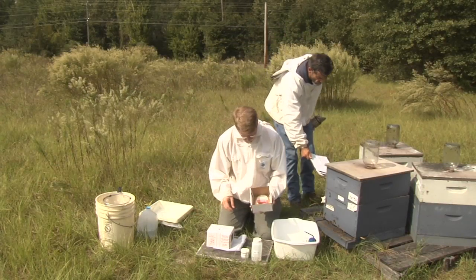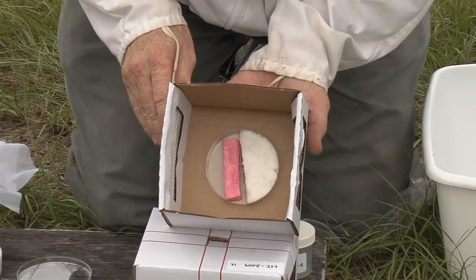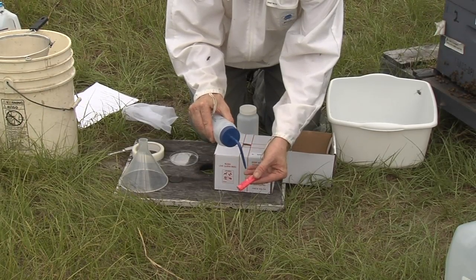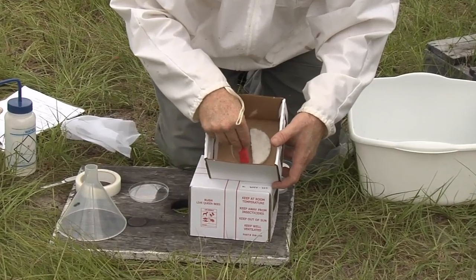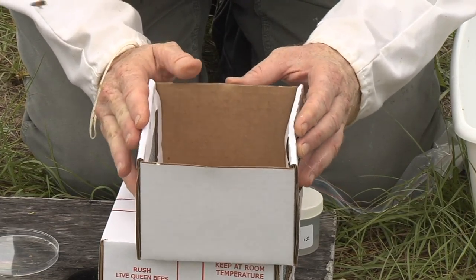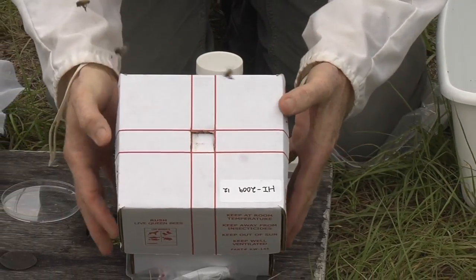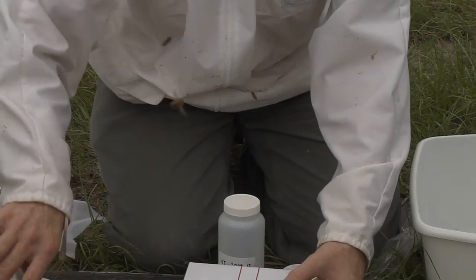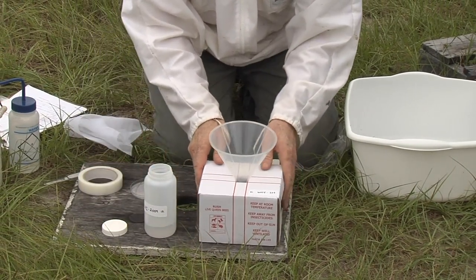Now set up the sampling equipment. First, remove the petri dish lid covering the queen candy glued to the floor of the box. There may be a piece of wax paper covering the candy which should also be removed. Next, soak the sponge in water and place it in the second half of the petri dish. The water and queen candy will provide nourishment as the bees are being shipped from the apiary to the lab. Now close the shipping box — compress the sides of the bottom of the box to enable the top to slide completely down and ensure the top is flush with the bottom so no bees can escape. Place the funnel into the hole on the top of the box. Finally, open the large alcohol bottle so it can receive bees.